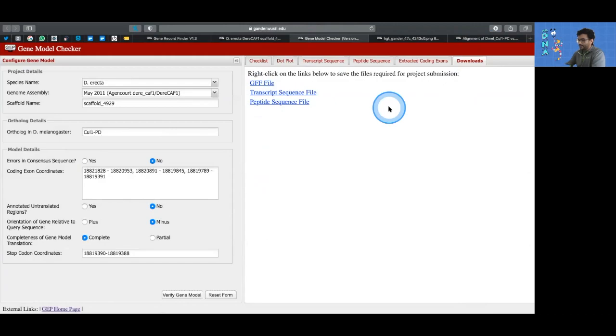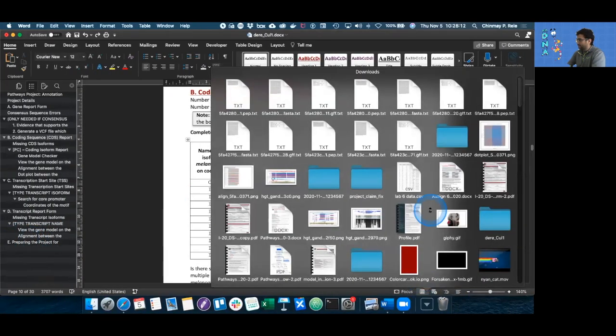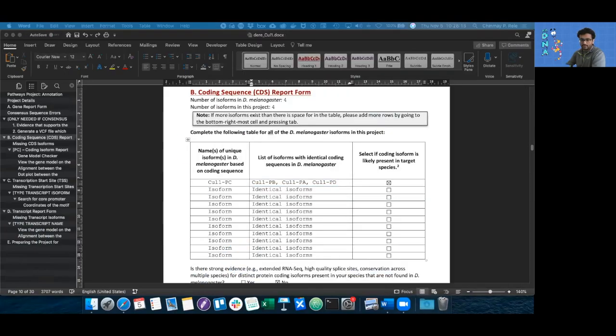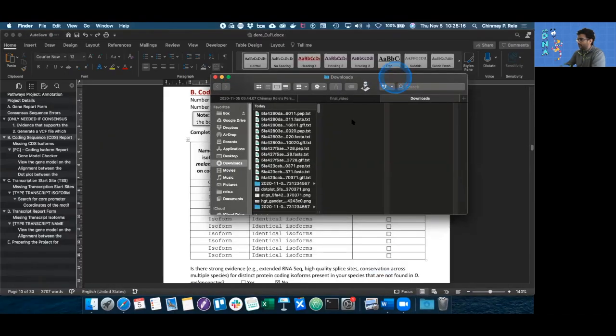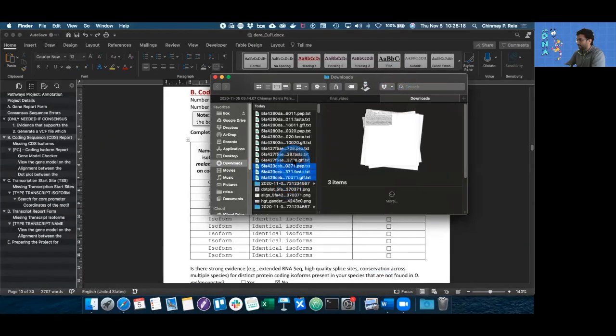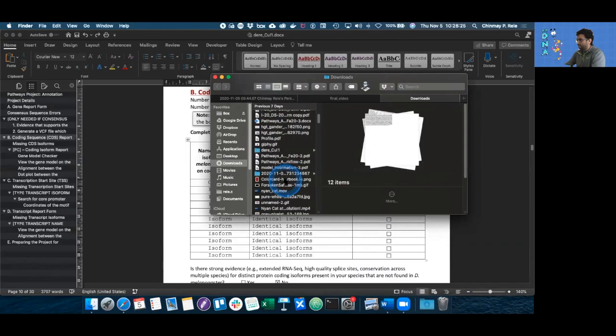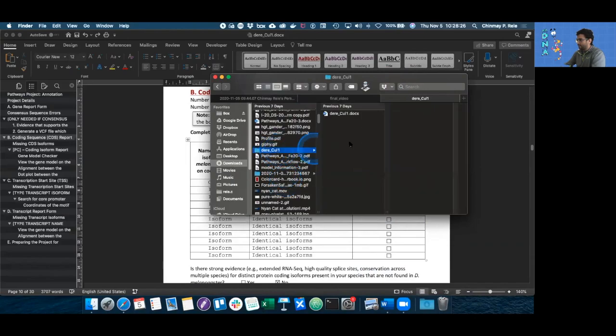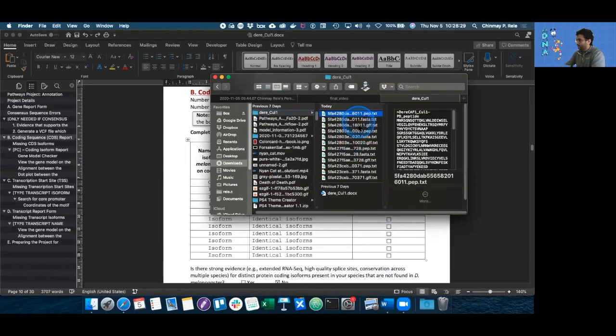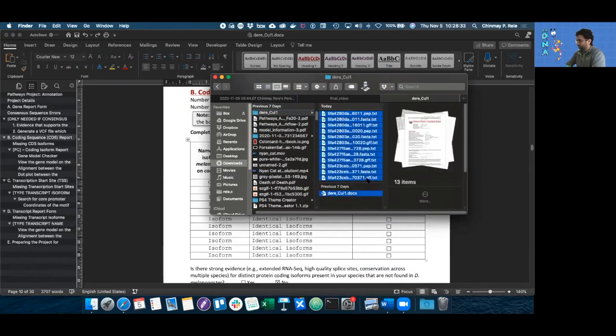Now that they're all downloaded, let's just see what the files look like in the file explorer or finder on Mac. So these are the 12 files that I have. There are three files each for four isoforms. I'm just going to copy all of them and move them to a D. erecta col1 folder I made before. So we're going to have 12 files, three files each for four isoforms.